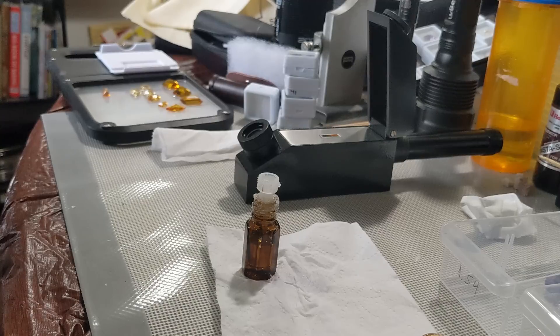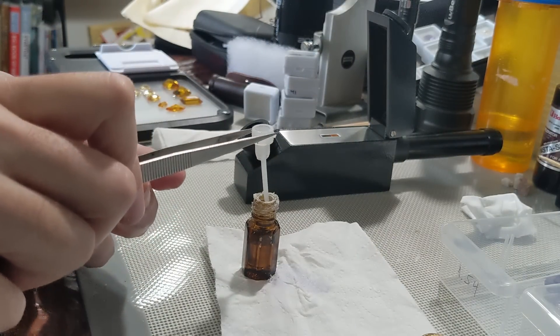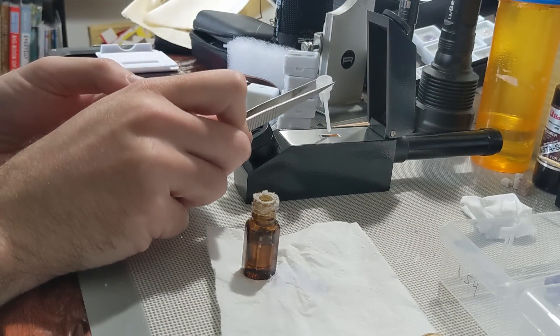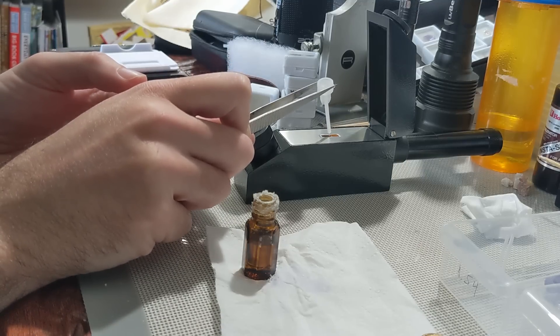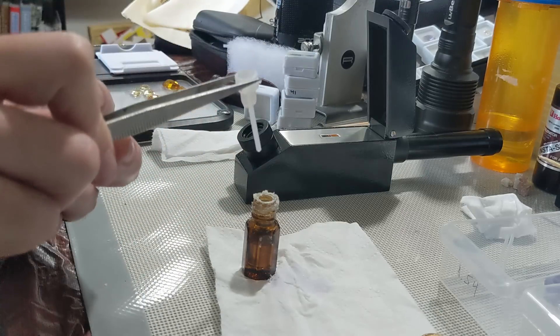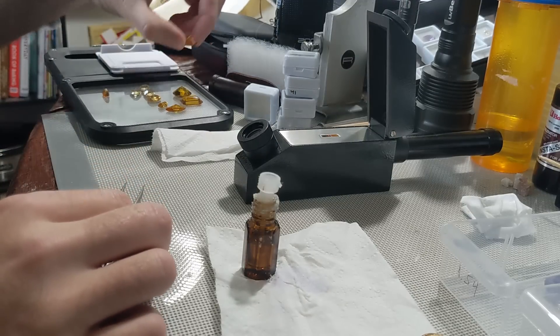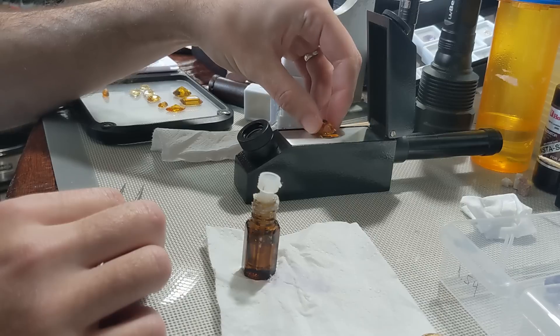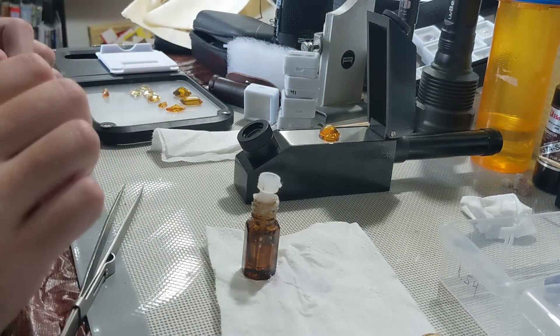Now let's talk about the refractive index fluid, or RI liquid. The composition is like methylene iodide or something nasty like that — it stinks and should be used in a well-ventilated area, and avoid getting it on your skin. My jar must have been sitting around for a while because some of it had crystallized, which you don't want because the crystals of the fluid are actually harder than the glass, which is also part of why you're supposed to wipe off the liquid after every use so it doesn't crystallize on the glass.